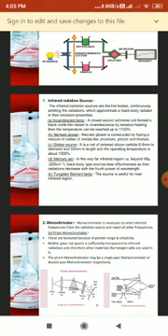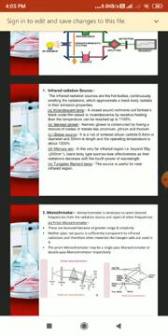Now, the fourth radiation source is the mercury arc. In the very far infrared region, that is beyond 50 micron, or 200 per centimeter, black body type sources lose effectiveness as their radiations decrease with the fourth power of wavelength. Mercury arc gives intense radiation in this region. It is enclosed in a quartz jacket to reduce loss.